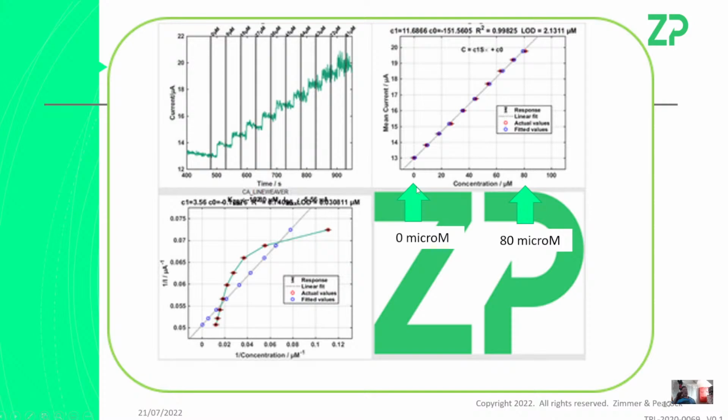So back to the nitric oxide sensing. I can tell you that the range that we test in is 0 to 80 micromolar. I can tell you that the pH we test in is pH 7.2, because we are often really thinking about human health a lot. Now that means our sensors can actually be used in non-human health applications, but by default, when I'm mostly talking now, I'm actually thinking about pH 7.2. We haven't tested outside of that.